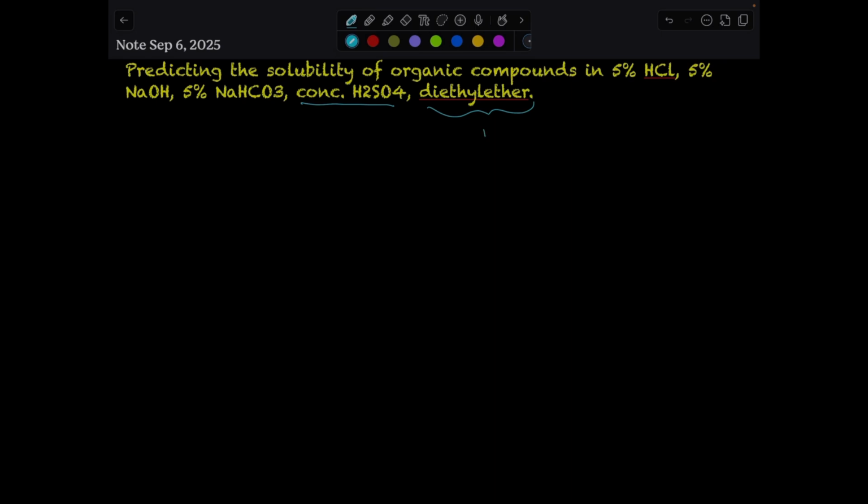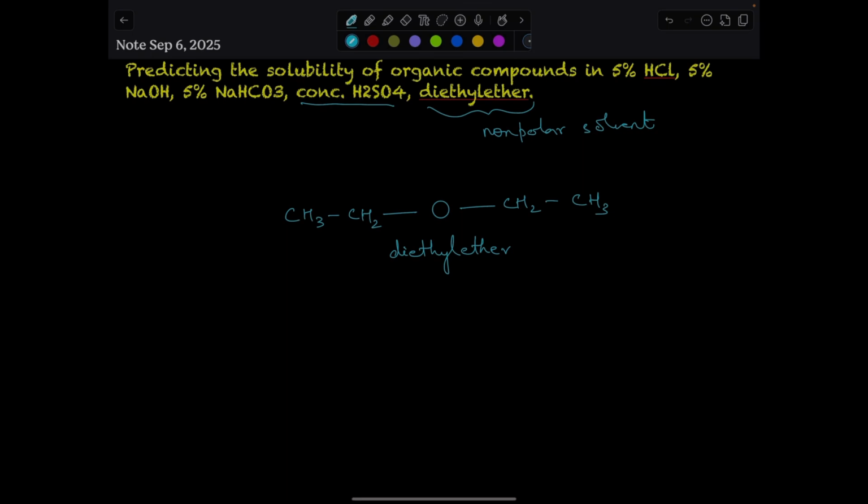Diethyl ether is a nonpolar solvent. Diethyl ether has an ether linkage and ethyl groups on either side. So recalling that like dissolves like, nonpolar organic compounds will likely dissolve in a nonpolar solvent like diethyl ether.